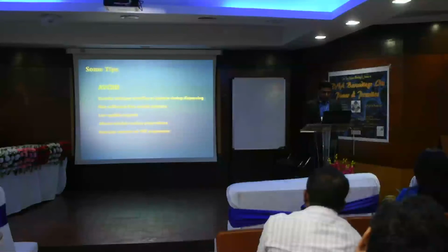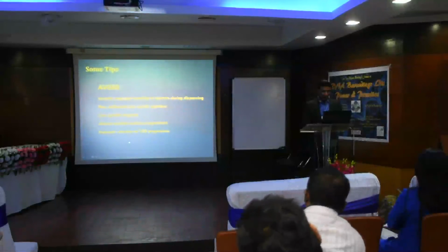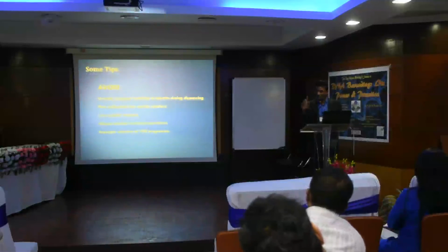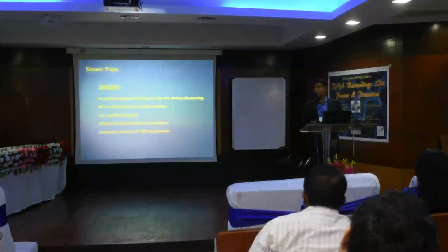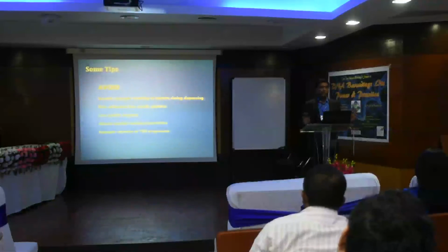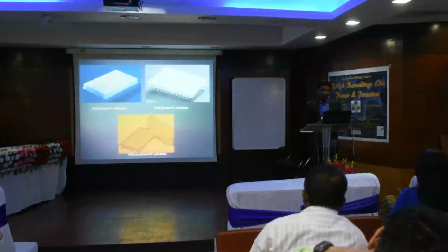So don't keep your machine running the whole night cooling down your samples unnecessarily. Improper selection of PCR programs also usually happens. In a rush you drop down and put something else, and I don't know why students feel so hurried in selecting the PCR program. They rush in selecting PCR programs and never go back and evaluate or edit whether they properly did it or not.